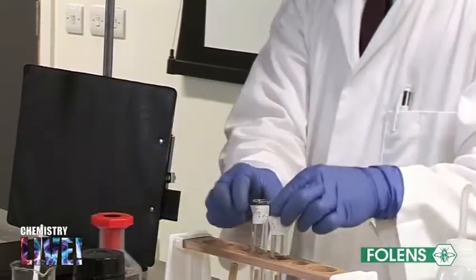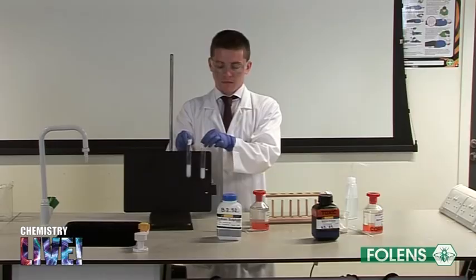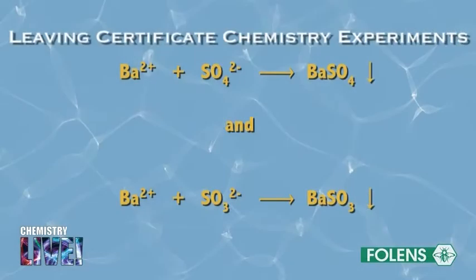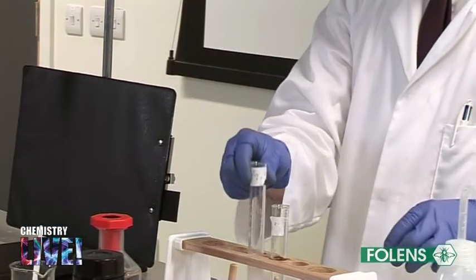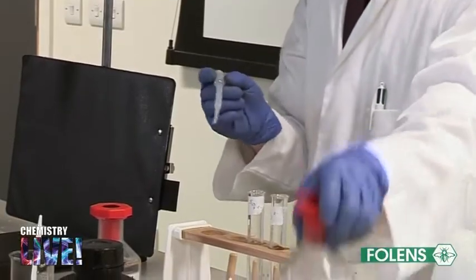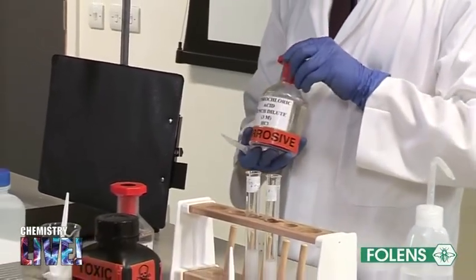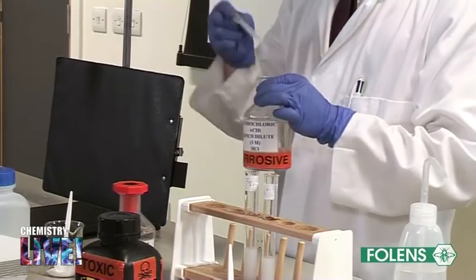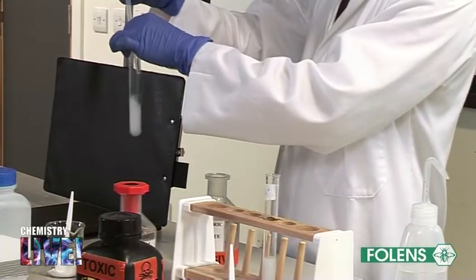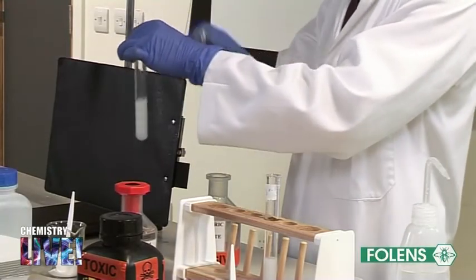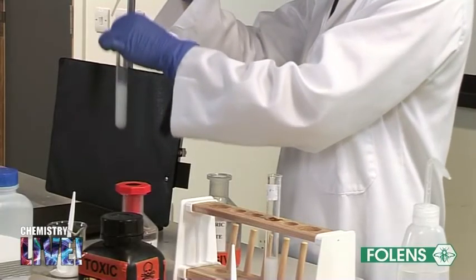The insoluble material formed is called barium sulfate or barium sulfite. These compounds are formed when the barium ions from the barium chloride solution combine with the sulfate ions and sulfite ions dissolved in the water. To distinguish between the barium sulfate and barium sulfite, add about a quarter of a test tube of dilute hydrochloric acid to each of the above test tubes and shake gently. Barium sulfate is insoluble in dilute hydrochloric acid.